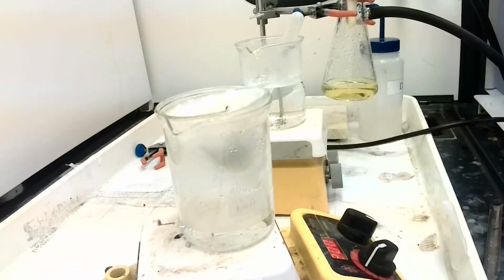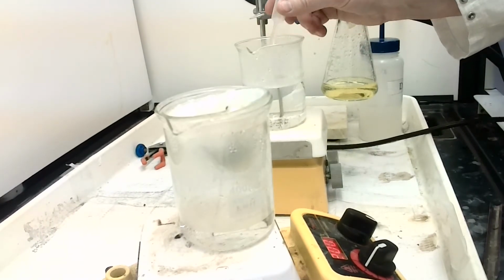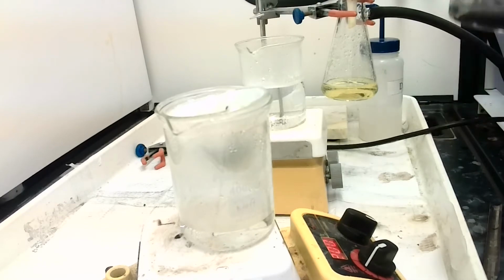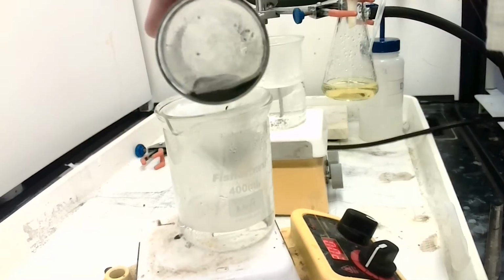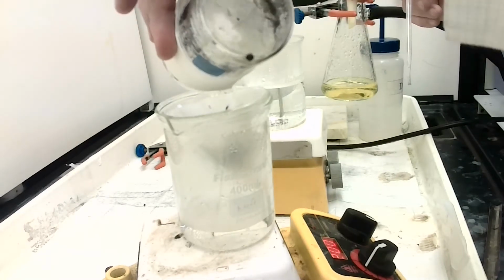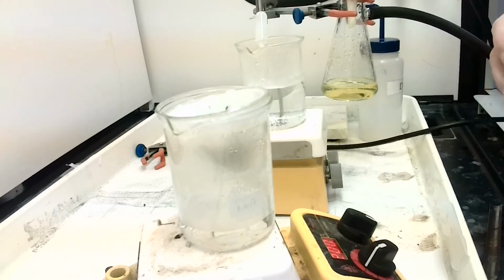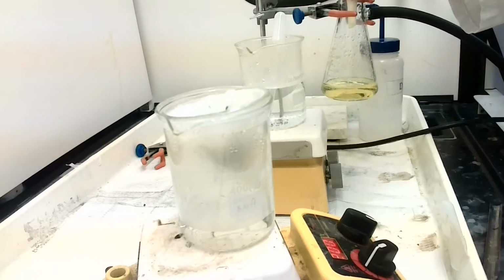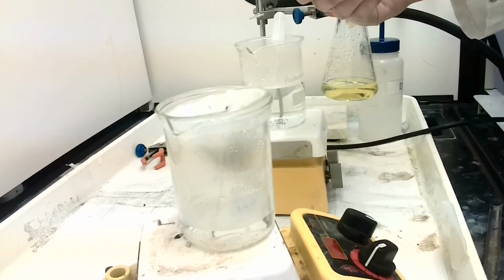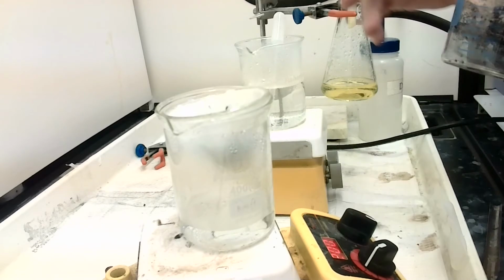I smell vinegar. Good. And I'm going to do a final rinse of this beaker. I think I've transferred all the product out. Give me one more rinse.